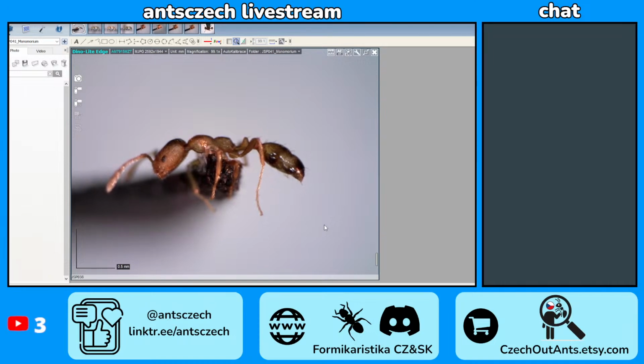Pinning, pointing. We all know that. But it's hard to see if the leg is in the way or not in that situation. And then you just try to not destroy the specimen while bringing the leg down. But the leg doesn't want to go down.